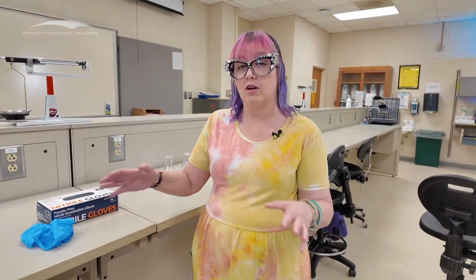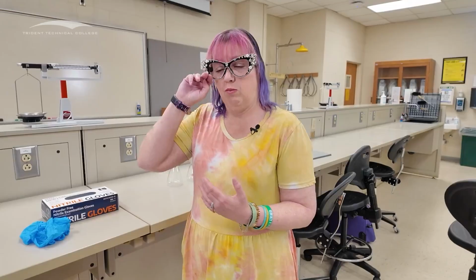And then I'm gonna put on another pair of gloves. And I'll do that before I handle anything in the normal part of the lab. Okay, because chemicals can be just about anywhere. So we wanna make sure that we're dealing with clean hands before we put them back into those gloves. Now, things that we need to make sure that we're dealing with when we talk about these experiments.